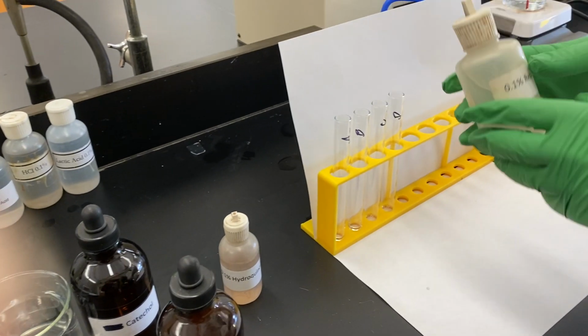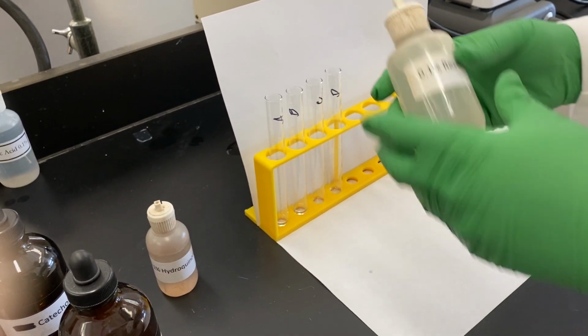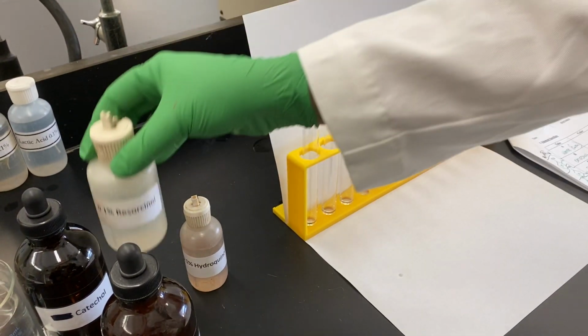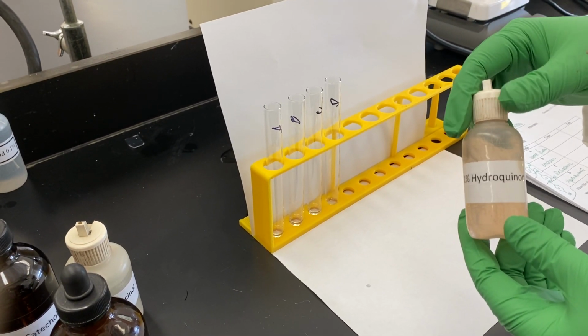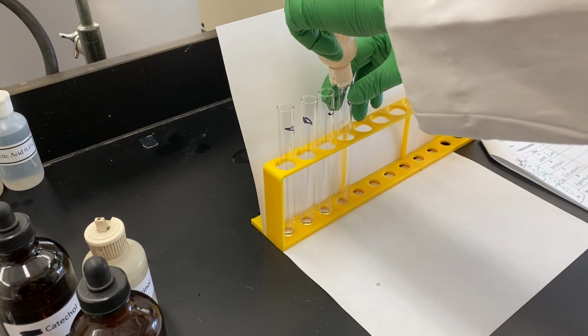In test tube C, 0.1% resorcinol. Again, we'll go with about 15 drops. We'll eyeball. 0.1% hydroquinone. This is going into test tube D, just like we've been doing, about 15 drops.